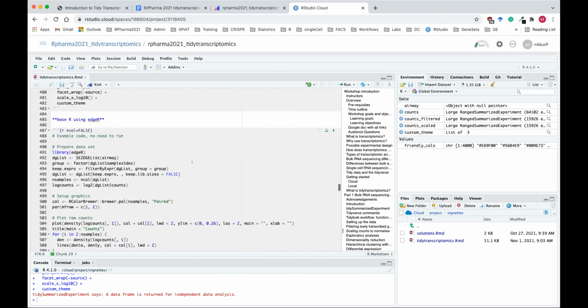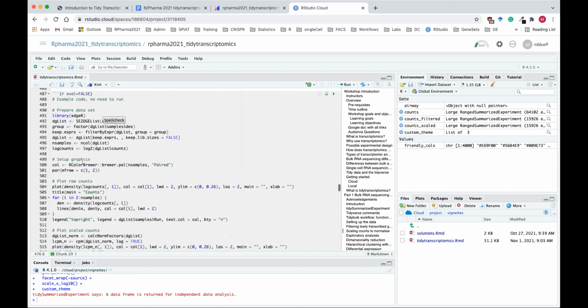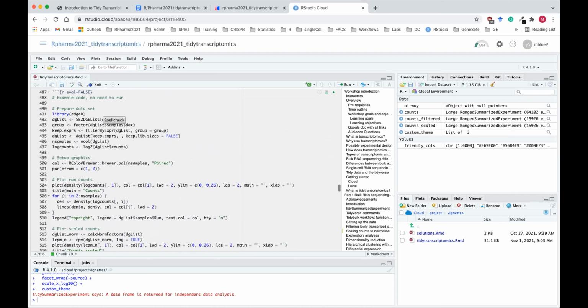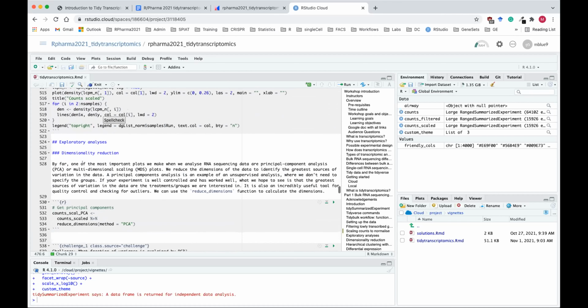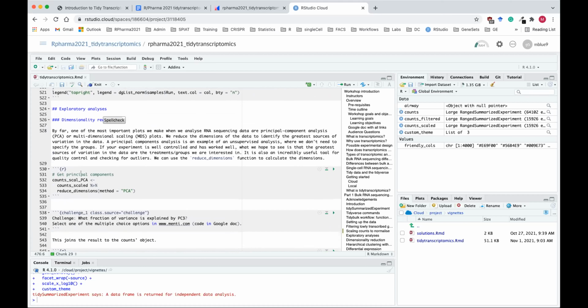A few lines of code compared to the more traditional way of doing it using base R, for example, with EdgeR, where this code block is showing we'd have to type a lot more code to be able to create similar density plots. So there's more chance for typos or bugs, and it would take longer to do that. So TidyBulk helps you to analyze your RNA sequencing data more efficiently.